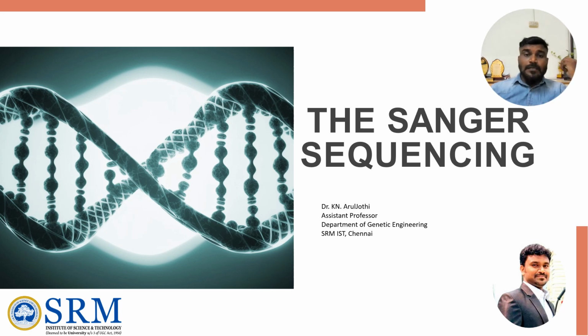Sanger sequencing revolutionized the area of human genetics and genomics. It is indeed a boon to the human race.